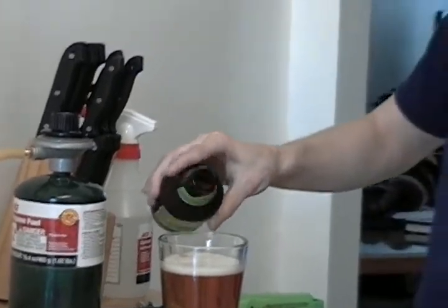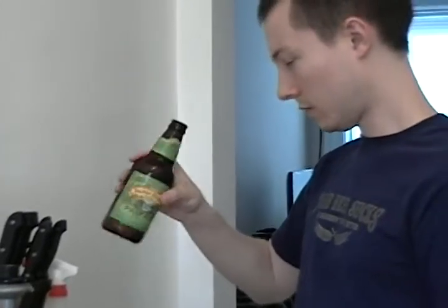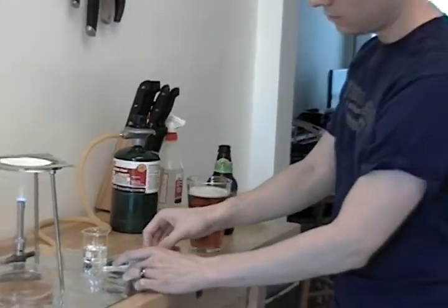Okay, now that we're close to the bottom, check that we got some yeast in there. Swirl it up in solution. And I have a little sanitized beaker here that we're going to pour the yeast into.